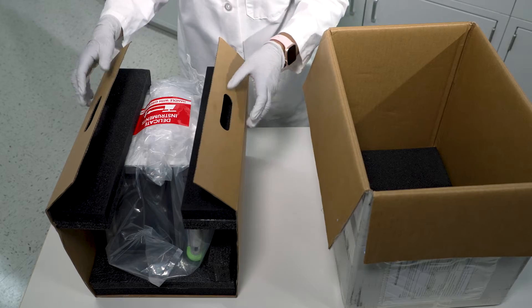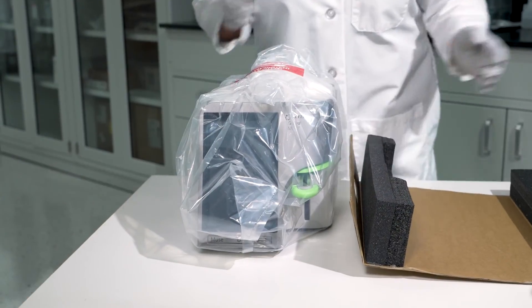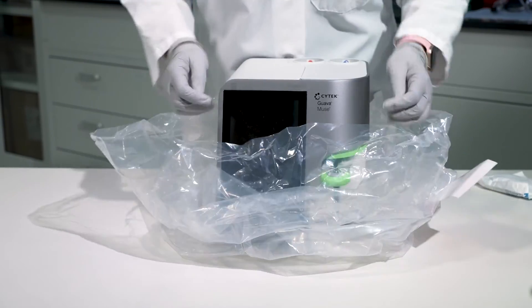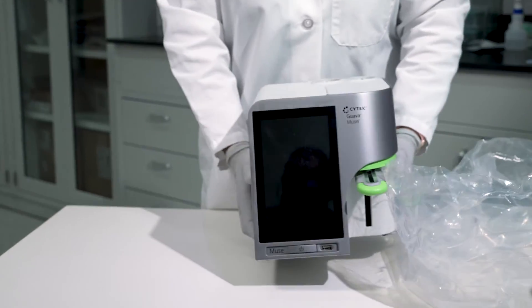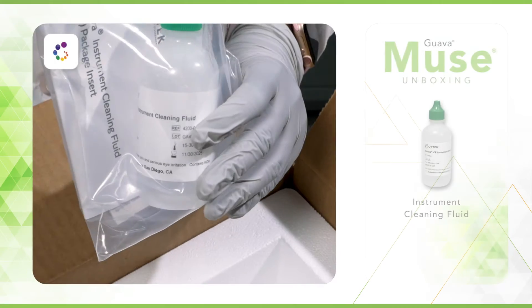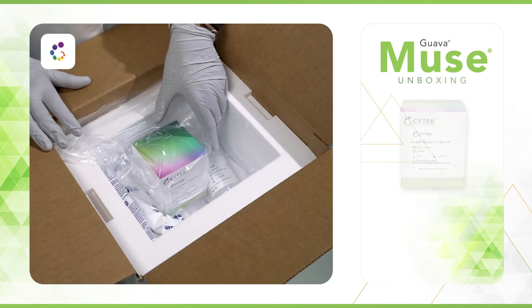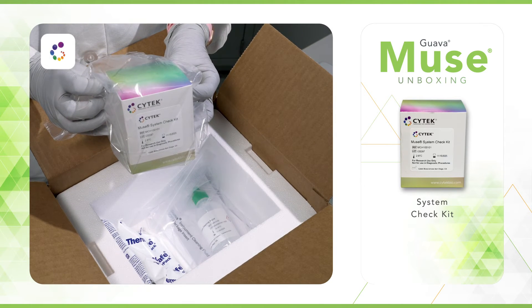Pull the instrument out of the box using the carrier handles and place it with the box insert on a stable surface. Open the plastic covering and place the Muse on a stable surface away from any equipment that vibrates. Next, locate the reagent shipping box. Inside, you will find a vial of instrument cleaning fluid that is necessary for proper maintenance of your instrument. There is also a Guava Muse system check kit, which is required to assess instrument performance.